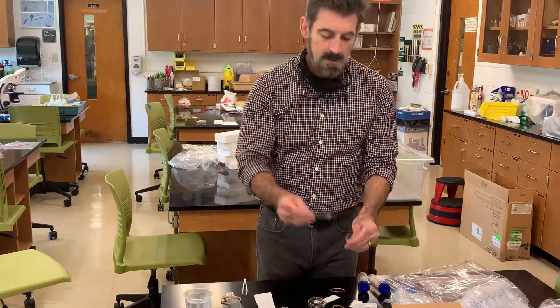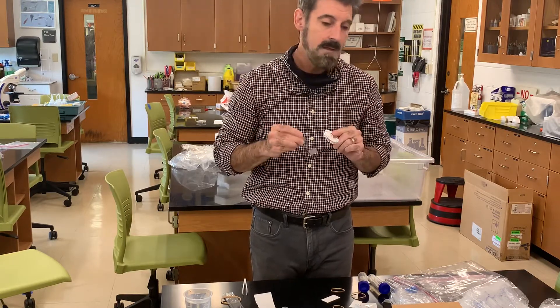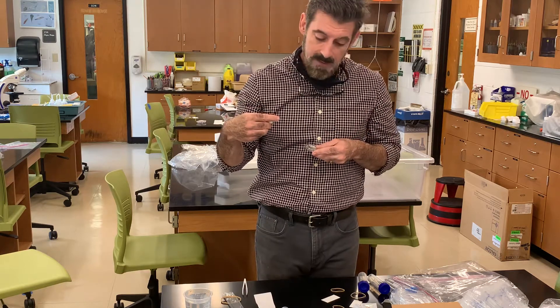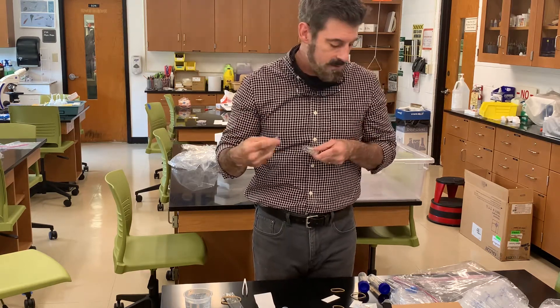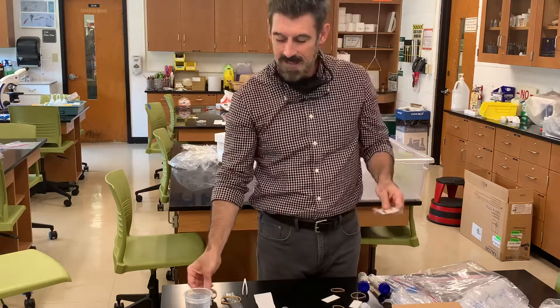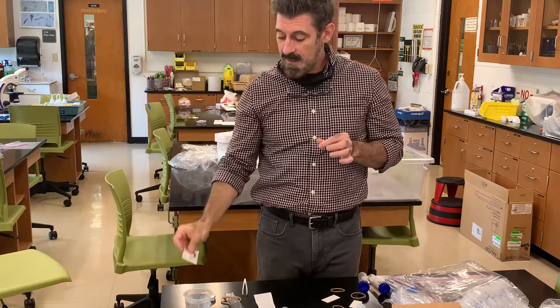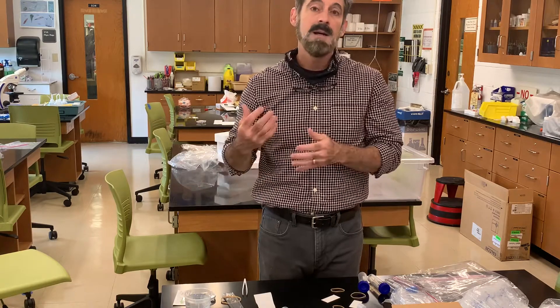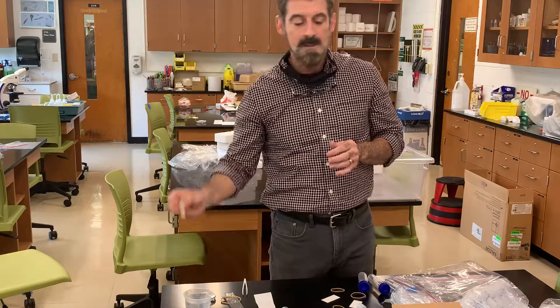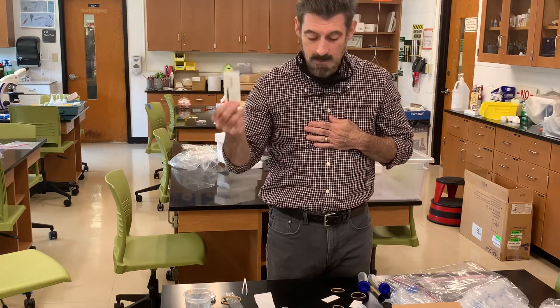There are some glass slides and cover slips included for slide preparation. Ideally, a mini microscope — really just a clip-on lens that attaches to a cell phone — was going to be added to the kit, but we didn't receive some of the parts I was going to assemble for you, so just hold on to the slides; we may still use them later in the semester. There's also another slide — don't open it — it's a sterile slide with a counting grid on it for counting chloroplasts, possibly used alongside the chromatography lab. If it doesn't work out, you may return that slide to campus.